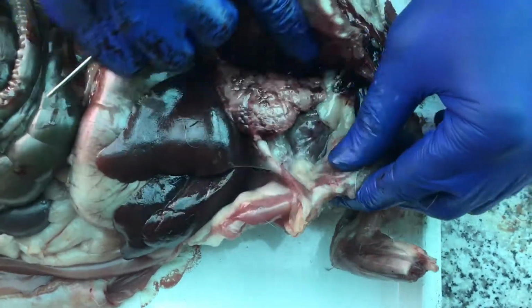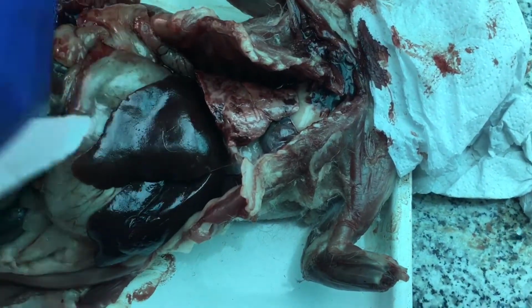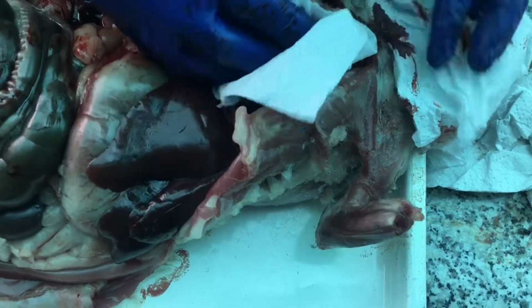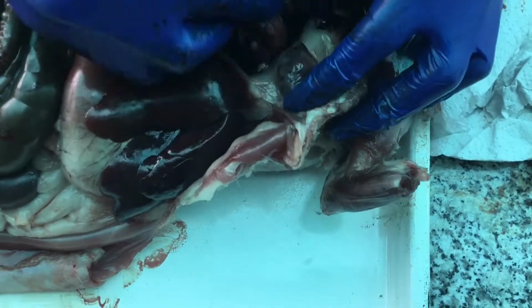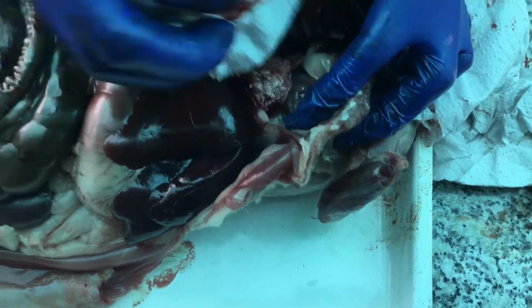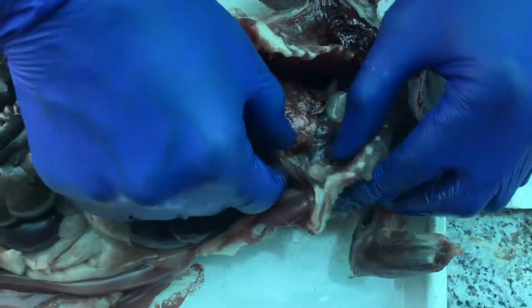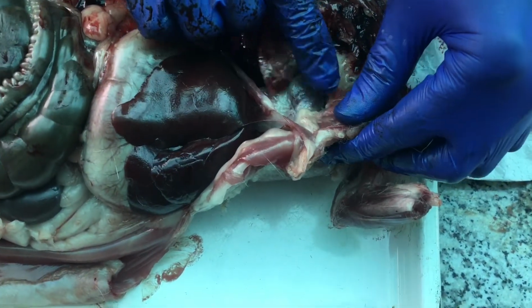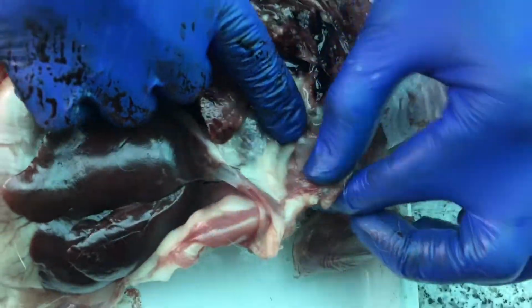Now that's what it looks like on the right side. In the chest cavity, we're going to tend to have more blood because the heart is in there. And I'm just going to soak up some of the blood. What I want you to appreciate is that the heart has a piece of serous lining that connects it to the ventral or the front surface of the ribs.